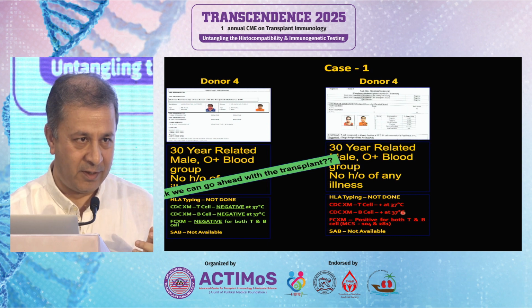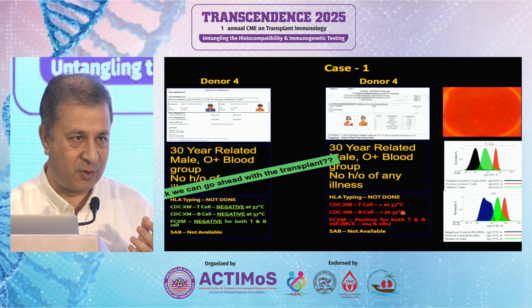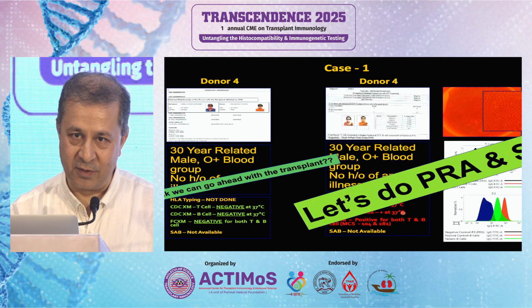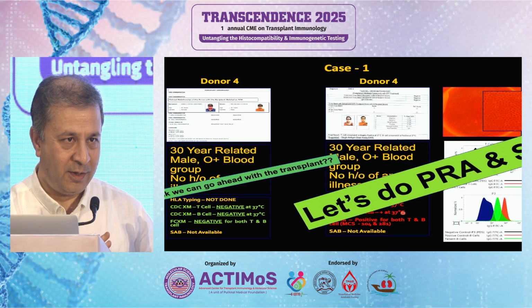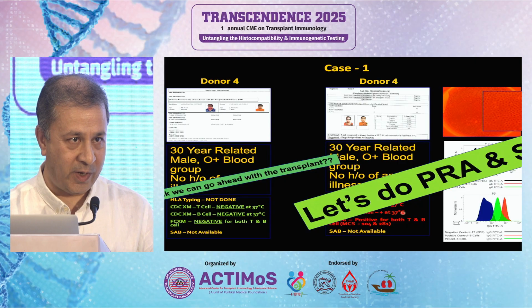And what am I left with? Left with nothing but to ask these guys to go ahead and do a PRA SAB. Let's see what that shows, okay? So we'll not really get into what happened later on in this case. We'll just park it in our minds and we'll come back to this case after my talk, okay?